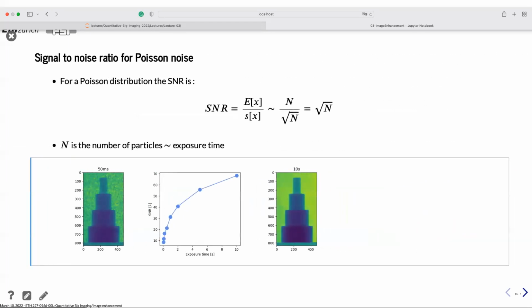So this could look something like this. In this case, I just measured outside of this sample. This is from a neutron image, and that is counting noise.